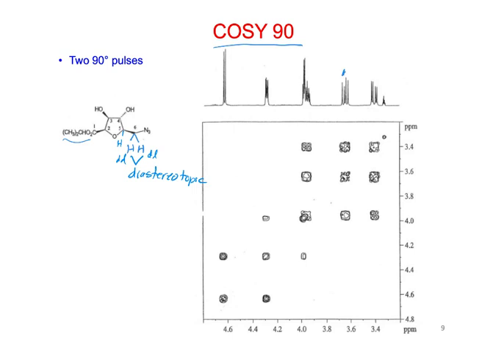If we're comparing the two, 5 and 6, 5 would be the more downfield because it's right next to the oxygen. Right, 5 would be more downfield than 6. Would 5 be the most downfield? No. What about 2? 2 probably, right? Because 2 is next to the oxygen, but it's hard to see here, it's also an ester, so it's also next to a carbonyl.